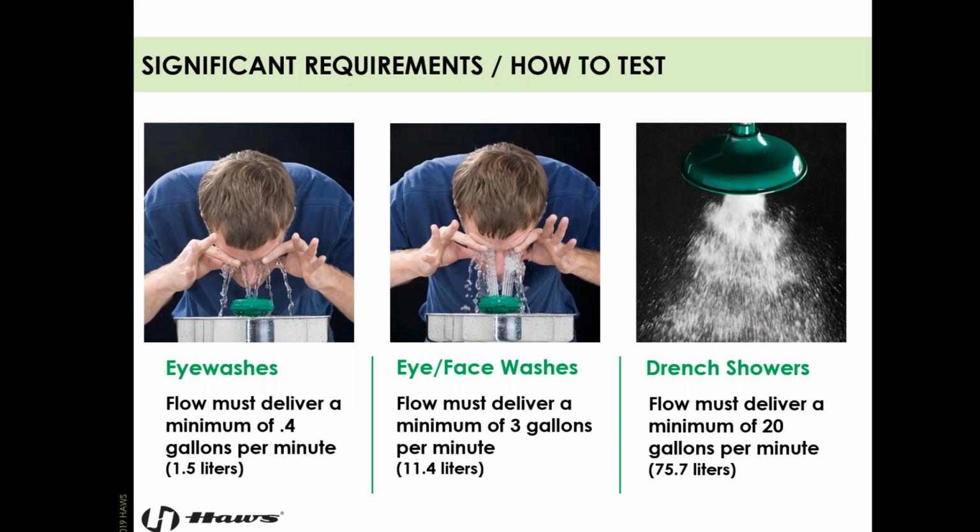It can go way above that, but then we risk, you know, the more water we're using, the more that we are going to risk damaging the victim, especially if you're dealing with corrosives, caustic chemicals, substances, and stuff like that.